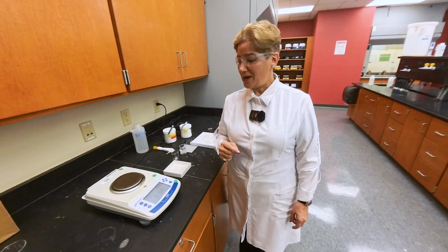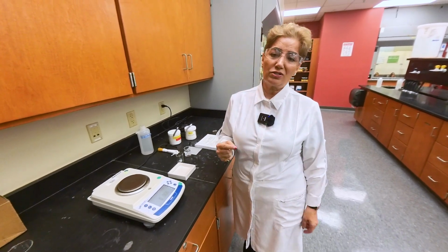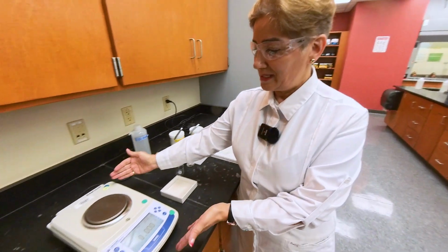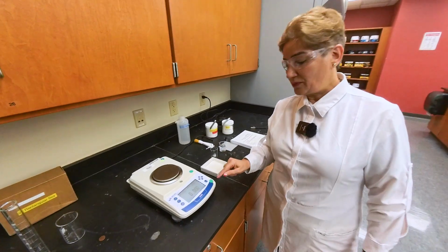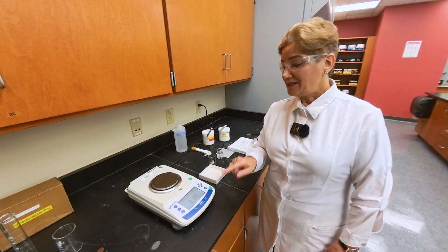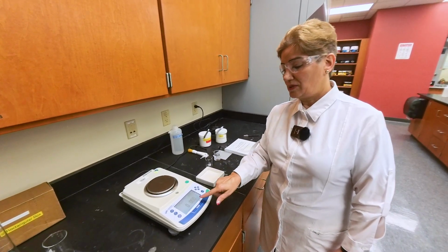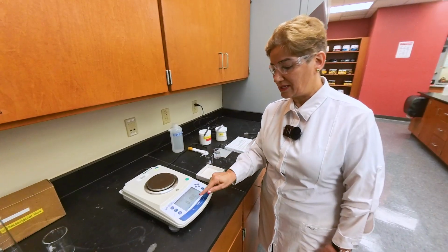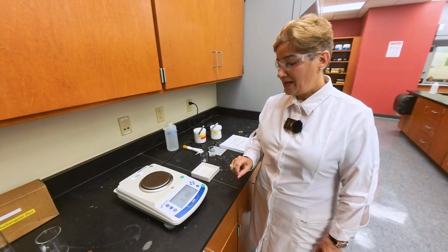Measurement requires a measuring device. The first part of this experiment is measuring mass. There are different methods for measurement. Measuring directly, the measuring device is the scale that we are using. This specific scale shows 3 decimal places. That means the accuracy of this machine is up to the 1,000th place, and you must record all those decimal places. Even if it's 0, you must record that.